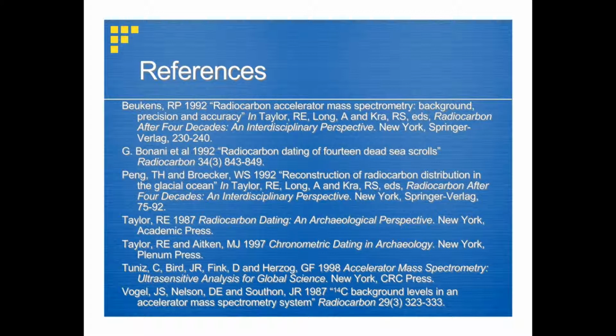And then those atomic species are bent through a couple of stages of mass selection and then a stage of energy selection or velocity selection. So that gets rid of most of the other stuff. And then the final step of separation is the detector itself, which uses nuclear physics techniques of energy loss in a gas counter cell. So this is a gas-filled detector typically, and as the species go in, they lose energy proportional to Z. Their range is proportional to Z, and so that's what helps give the discrimination.